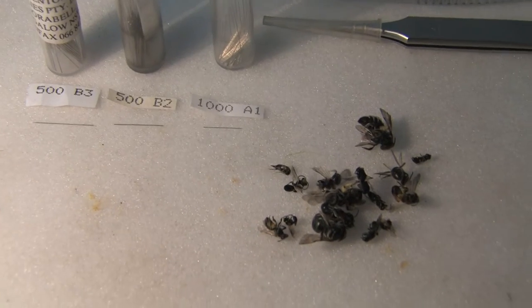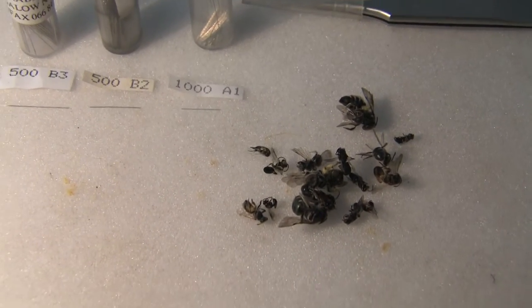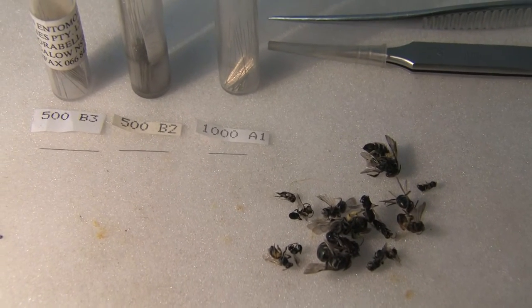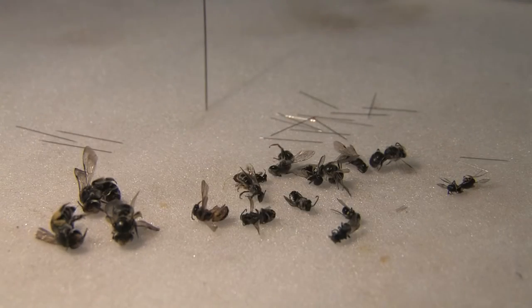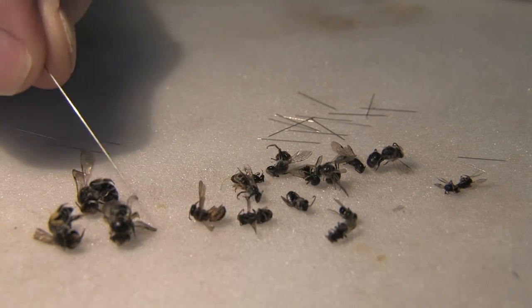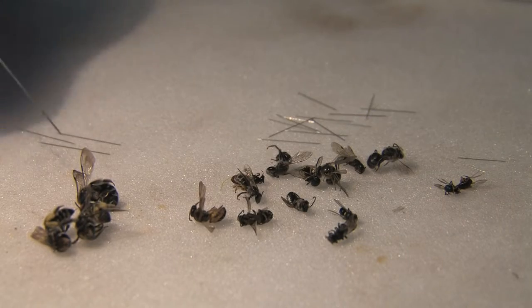You make a choice as to which pin you use for which bee — for the larger bees you obviously use the B3s, and for the smaller ones you use the B2s or the A1s. Now I've separated the bees into large, medium, and small. I've decided to use the B3s for the three large ones.